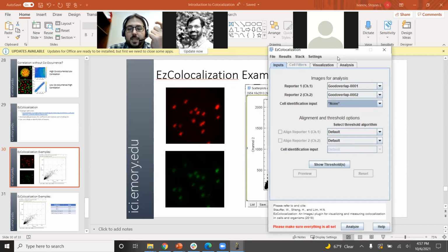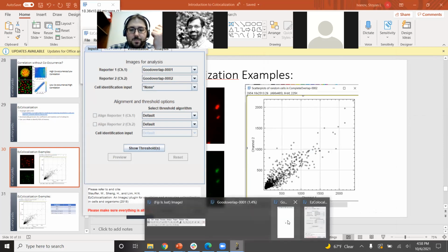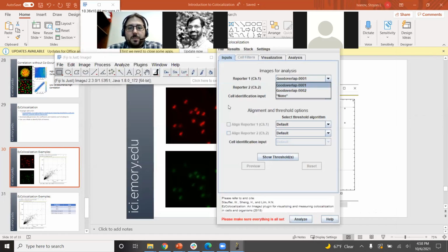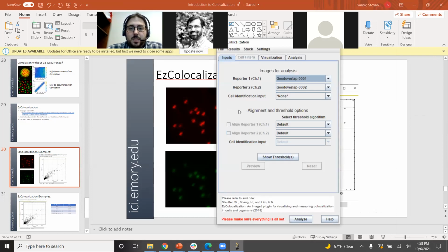If we were interested in creating our own region of interest, we would be able to do that as well. We will go through an example of that later on. But for the two images we have, 1 and 2, we will just look at the whole image initially.